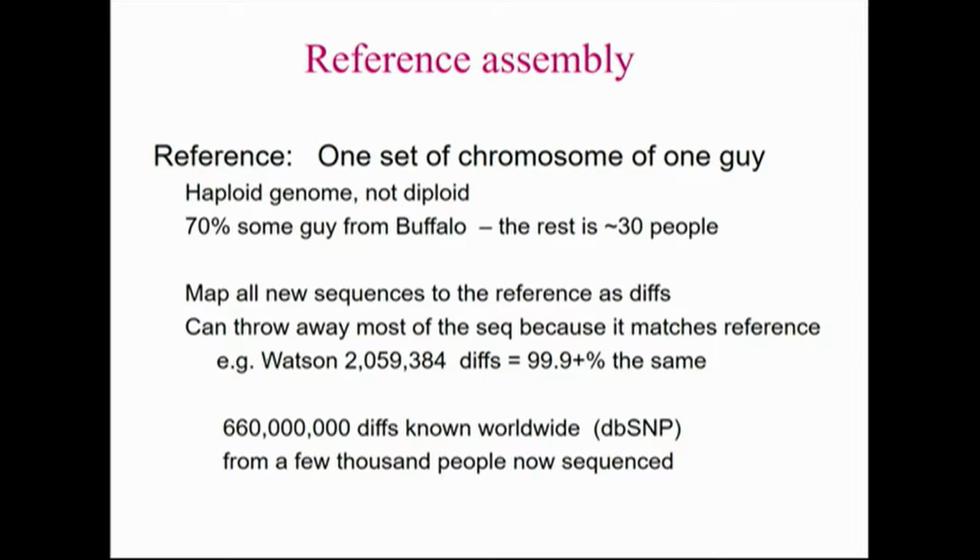It's going to have some places, and there are places where there are private SNPs, where that guy had a variant and nobody has seen it since. That's something to keep in mind when you're doing your bioinformatics. If you see a variant relative to the reference, it could be that the reference is the weird one, not you. You know, all of your samples may have those same variants, and most bioinformatics pipelines now are aware of many of those.